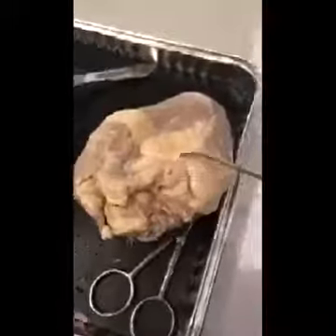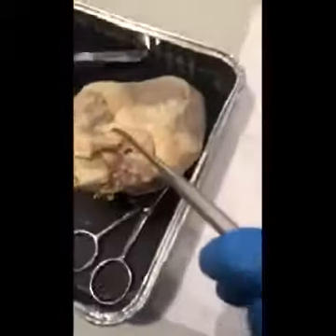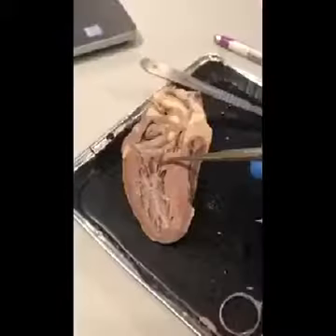Right over here we have the brachiocephalic trunk, which is the branch of the aorta that splits to form the right subclavian artery and right common carotid artery.